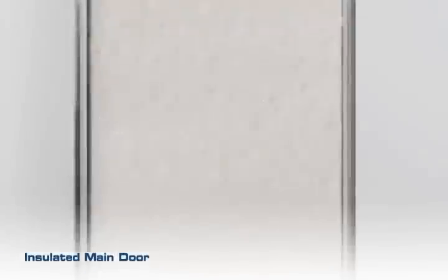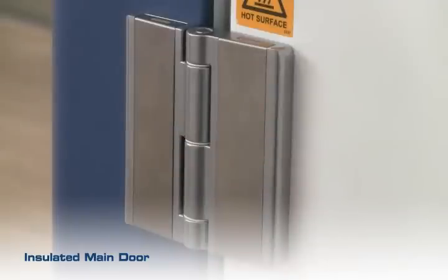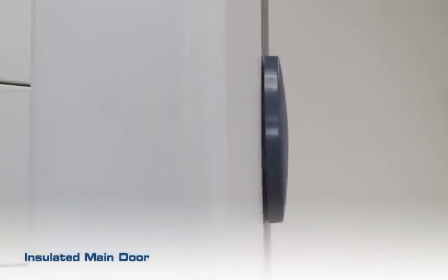The outer door is sufficiently insulated with 114mm 4.5 inches of polyurethane foam. Three durable hinges are used, allowing a 180-degree opening of the door and easy passing of the unit through the lab doors.